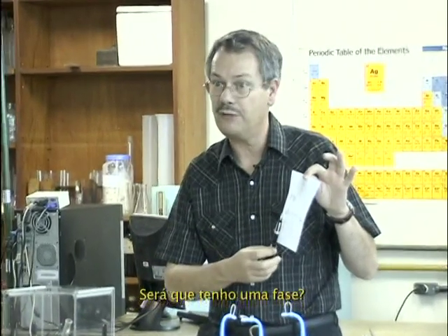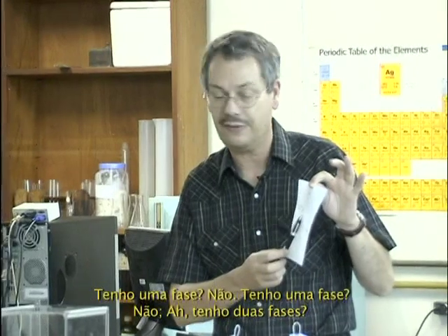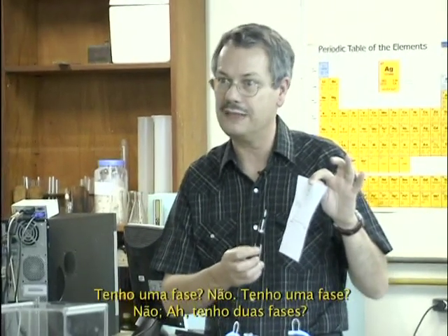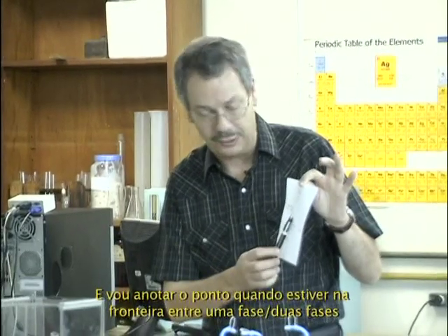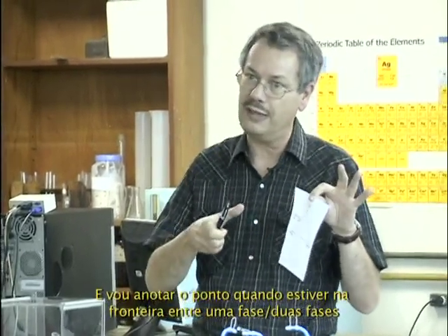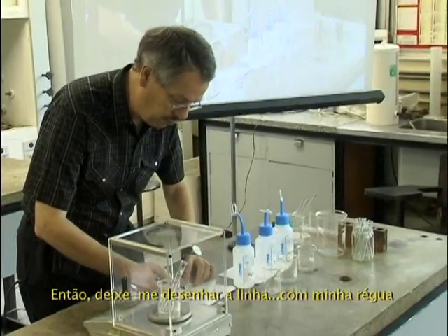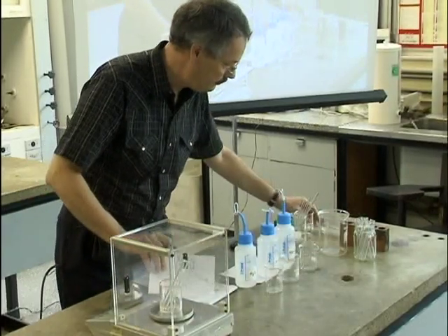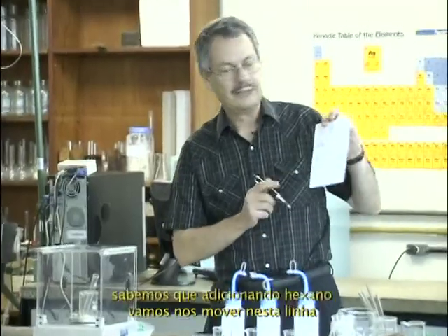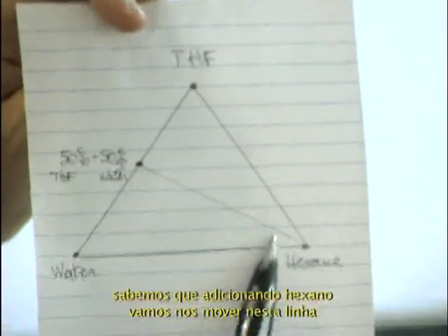Do I have one phase? I am in a one phase zone. Do I have one phase? No. I am in the two phases zone. And I will write down the point when it goes from one phase to two phases. So let me draw the line with my ruler, special ruler. We know that adding hexane, we will move on that line.